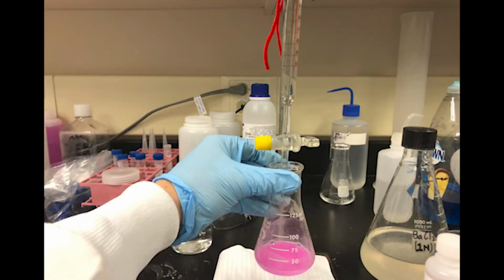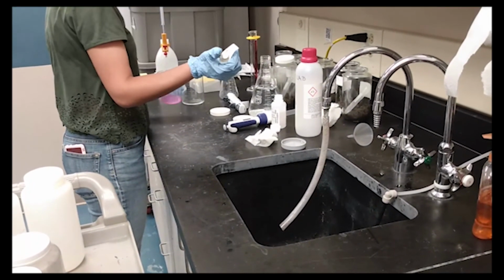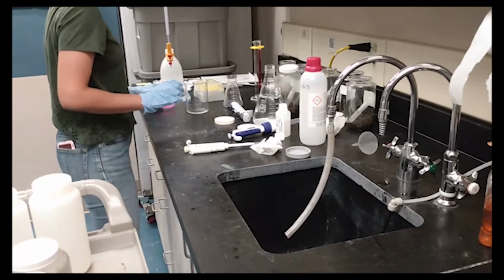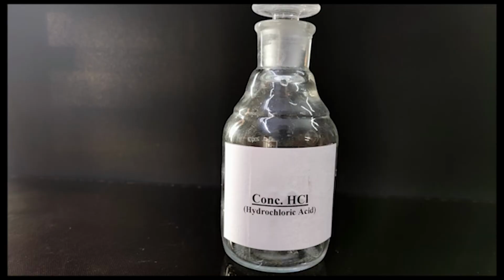So in this case, we had 5 mL of a 1 molar solution, which we put in with the soil. If there was no carbon released, if it was 100% conserved, then we will need 5 mL of 1 molar concentration acid to neutralize that basic solution.